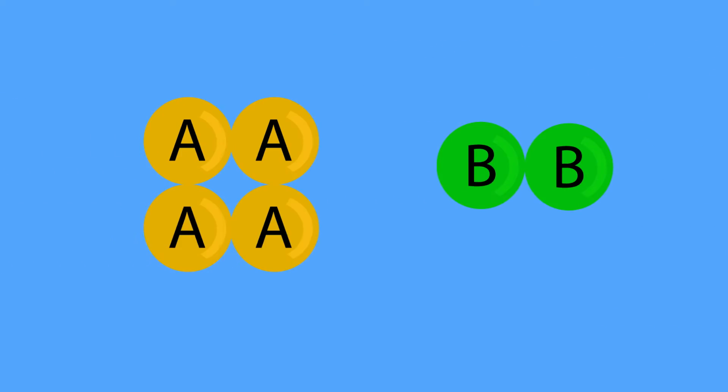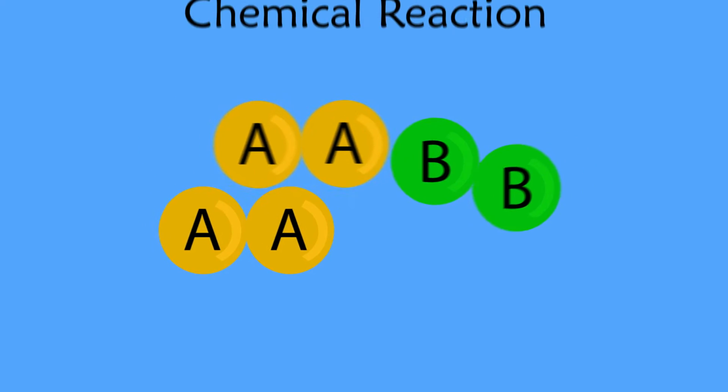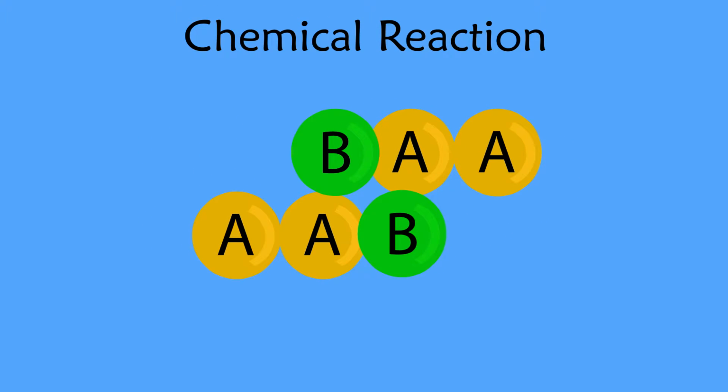In the third type of mixture, component A chemically reacts with component B, and the product of the reaction may have lower or higher density depending upon the chemical reaction. The density of the product depends on the chemical structure of the molecule formed.